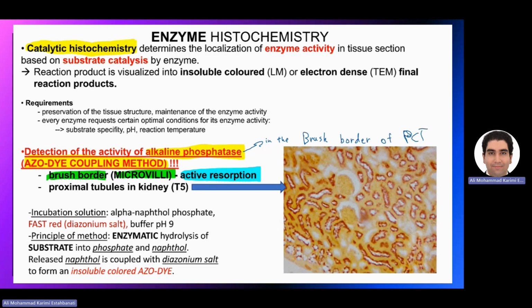Speaking of kidneys, this picture you see here is a kidney. As you see, it's very difficult to determine that this is a kidney. However, because of the color, we can determine that this is an azo coupling. But this is a misleading question because some professors will ask, it's a kidney of which animal?